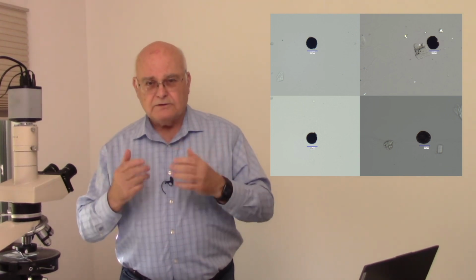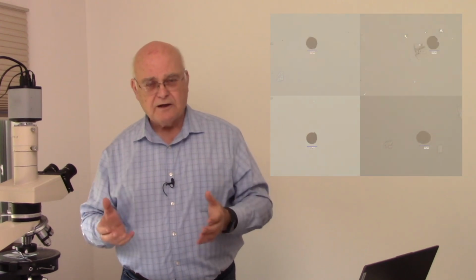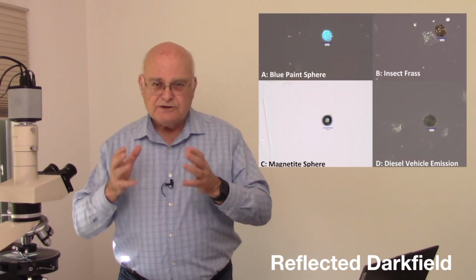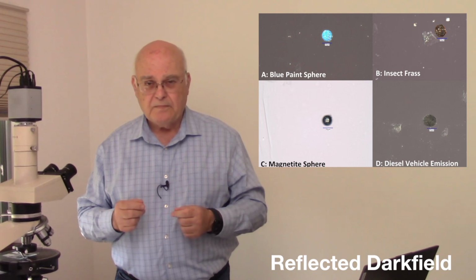These particles were opaque, not necessarily black. By using reflected light, we could see that these 25 micron size particles were not all the same.